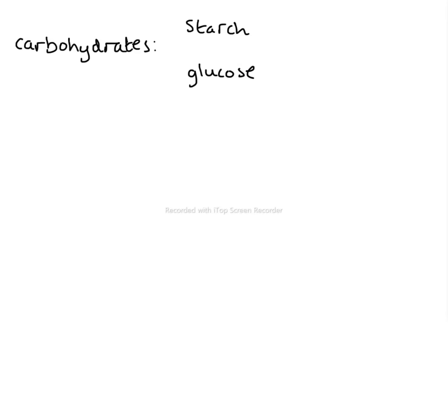Okay, starch is simple. You're going to add yellow, brown iodine solution, and if starch is present, it will turn what color?